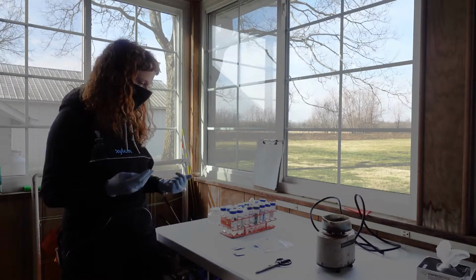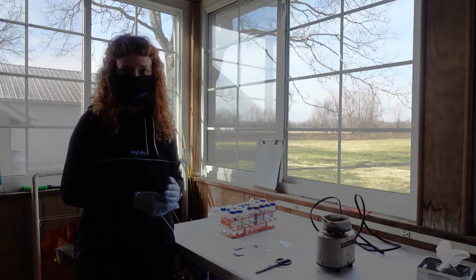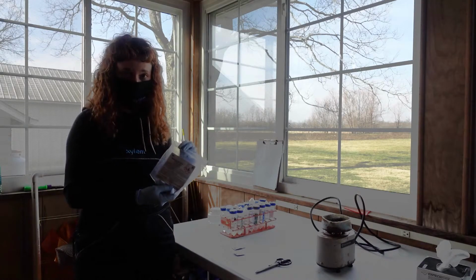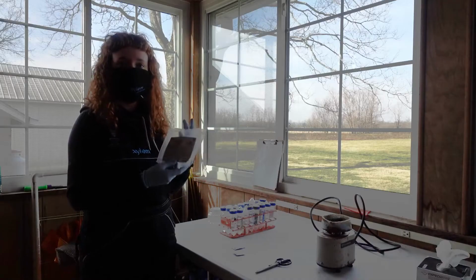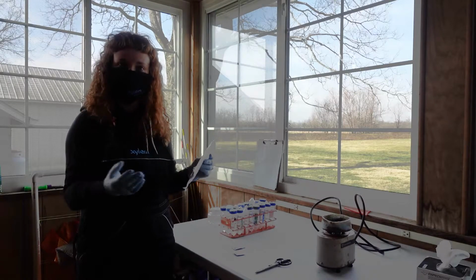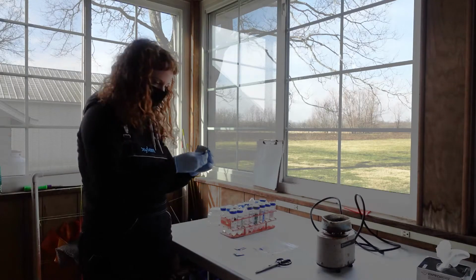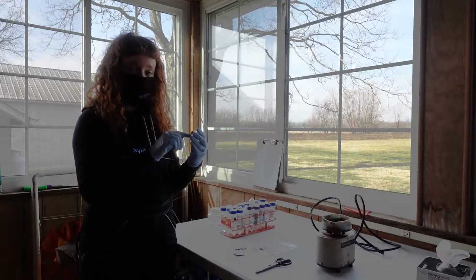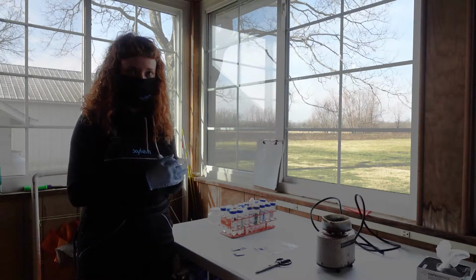So for this method, we're running a Hach Chemical Company method specific for nitrate measurements in water samples. When you come in for the day, you'll find a pouch for this reagent called Nitraver 5. It's important that you make sure that you have the right pouch at your station. Otherwise, your reactions won't work. Inside the pouch, you'll have many of these small pouches that contain the reagent. They say HR nitrate. And so it's good to check those things when you start running your reactions.